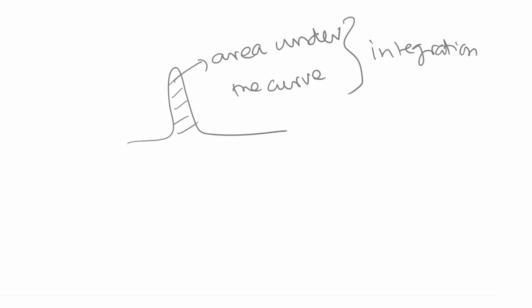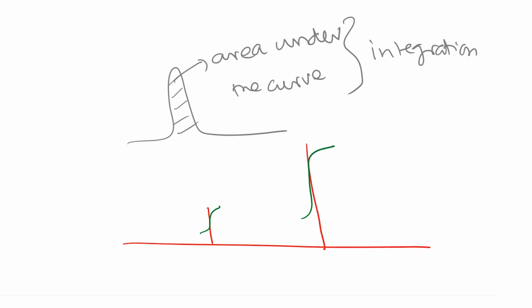So, in NMR spectroscopy, what we normally see are quite sharp peaks. What is useful to know is that when you integrate it, the integration is represented like this, and the height of these peaks becomes important.